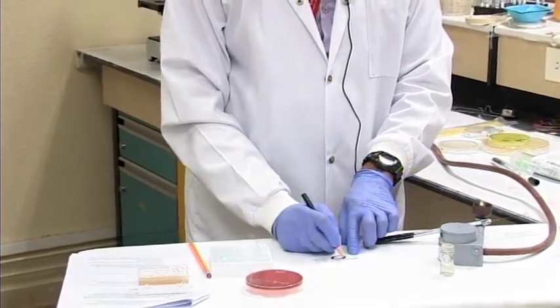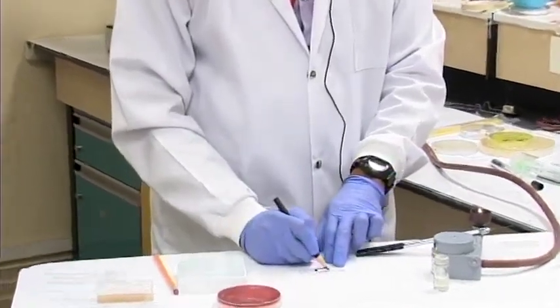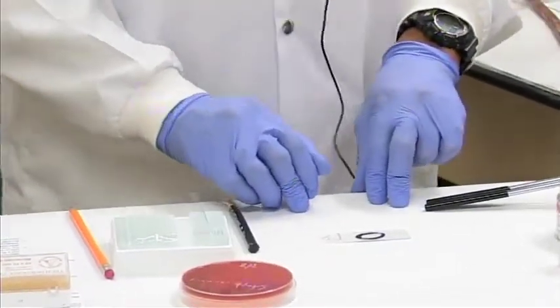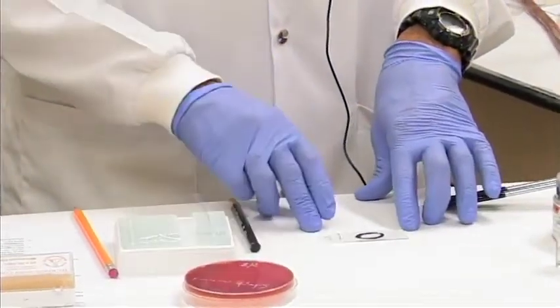Sometimes, if the slide is not easily marked, you can warm it a bit with a Bunsen flame, then put it flat down, and again make the mark with a wax pencil, where you get a nice circle on the slide. That circle helps keep the stained item within a space and doesn't use up too much stain.